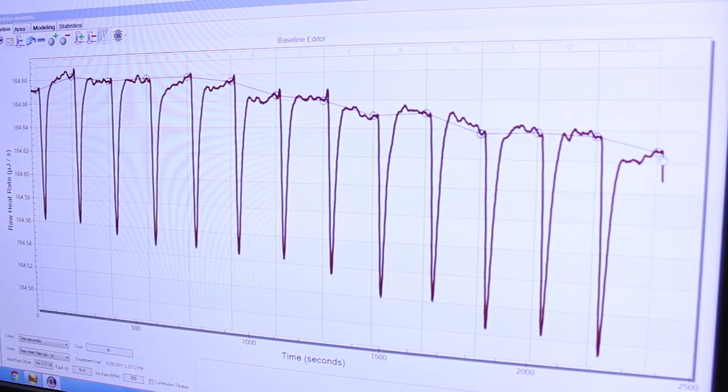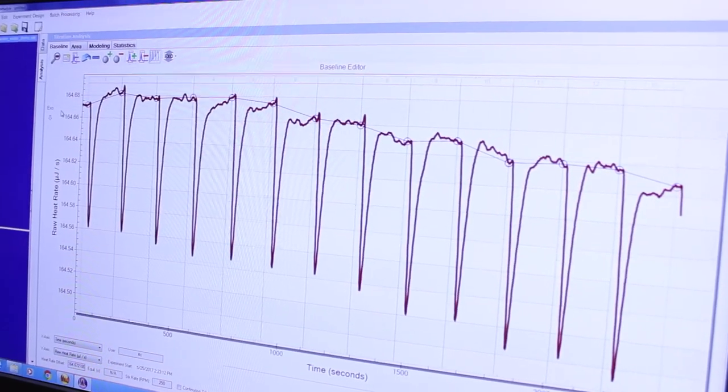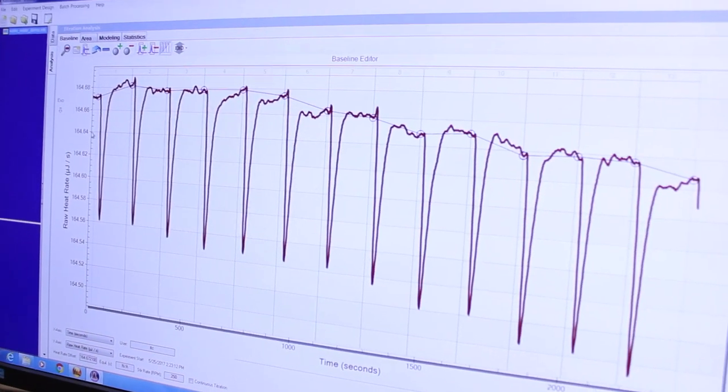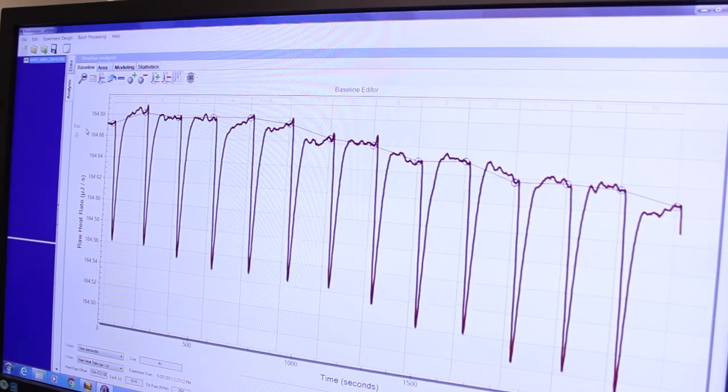We also see that the baseline is not perfectly stable and the program has set these control points in an effort to smooth out the baseline. For information on analyzing and interpreting ITC data watch for another video or read the user guide.